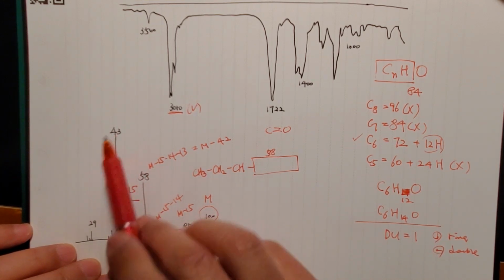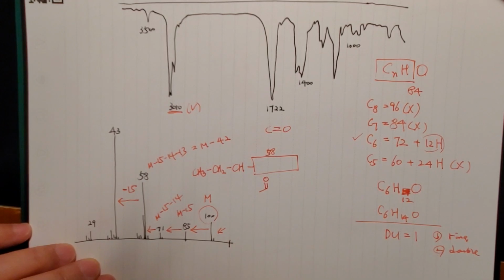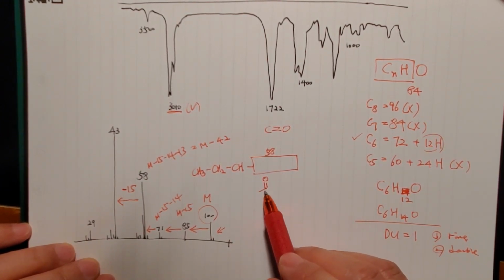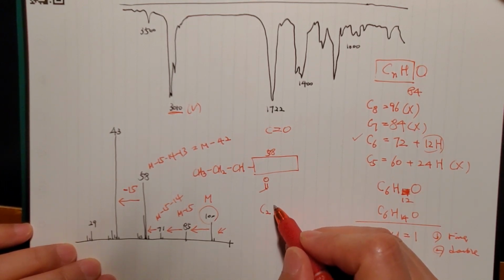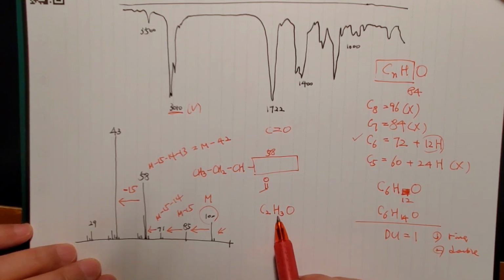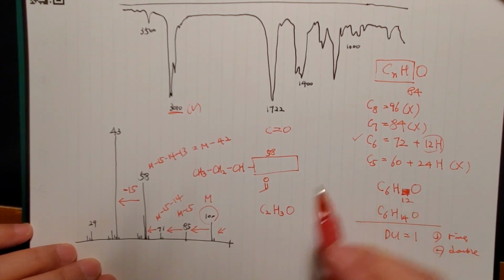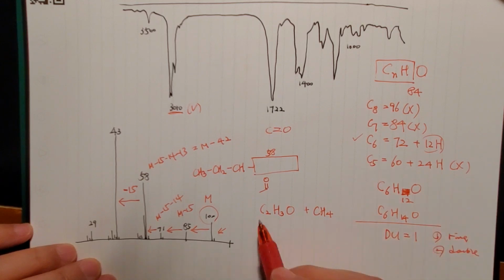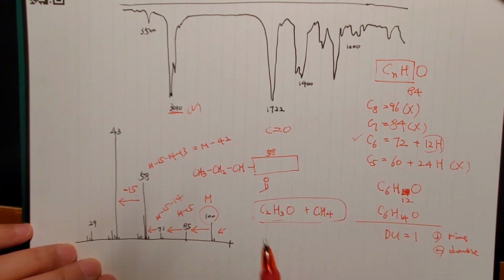Now also in 58, 43, you must have a ketone, not an aldehyde, meaning you must have this here. That's a minimum thing required, and you have more carbons. So including these, minimum C2, and how many H's there? 3, and oxygen. Minimum this. You've got to make up 43, and with one more additional methyl group, you have to make 58. So you know there is one more methyl group. So these together with the additional thing here, that's a minimum thing required in this structure because it is a ketone.